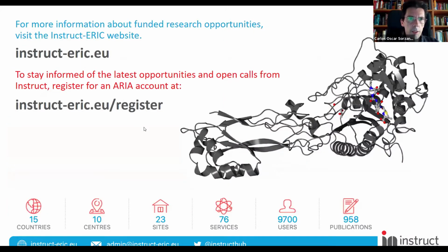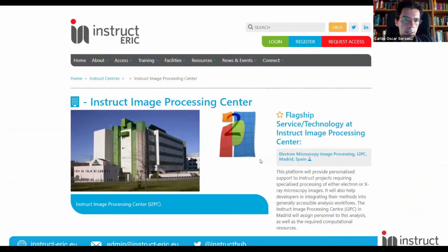Then, these are the two web pages: Instruct-ERIC.eu. If you want to keep up with the news and everything, you can see there are almost 10,000 users currently registered. And one of the Instruct centers is ours. It is the image processing center, and we are mostly focused on the image processing of cryo-EM data and also some soft X-ray tomography, but much less.